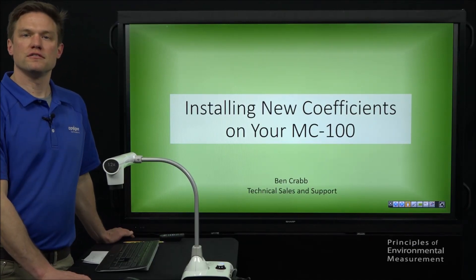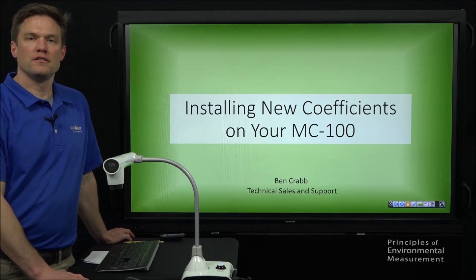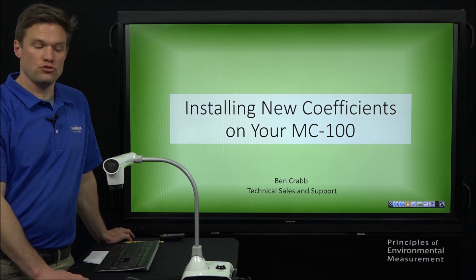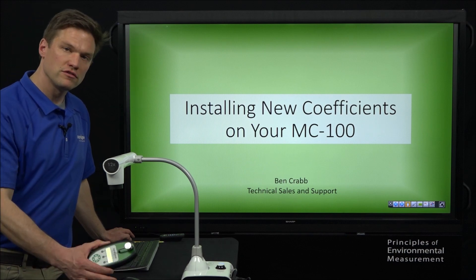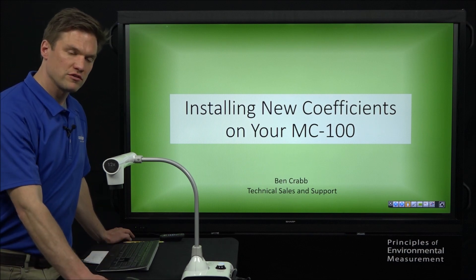Hello, my name is Ben Crabbe. I do technical sales and support here at Apogee Instruments. Today I'm here to talk to you about the process to load new coefficients onto your MC100 chlorophyll concentration meter.